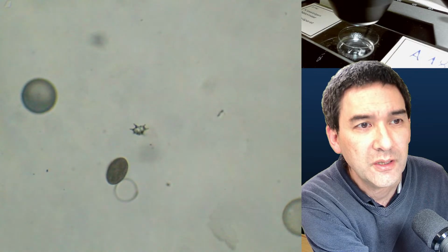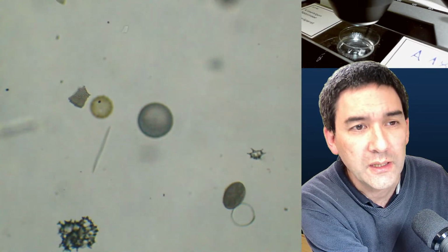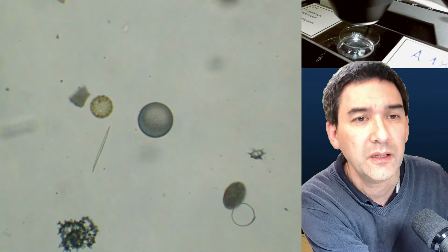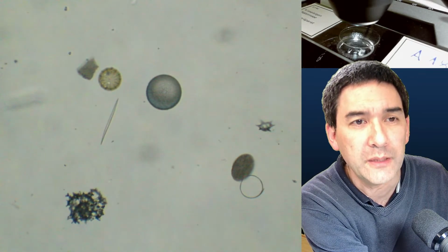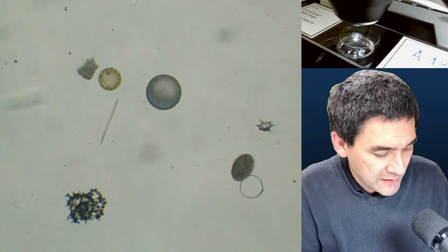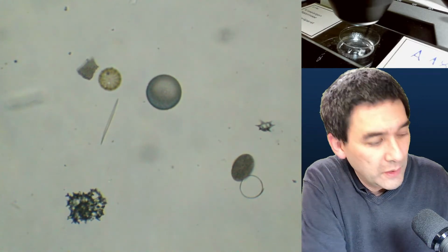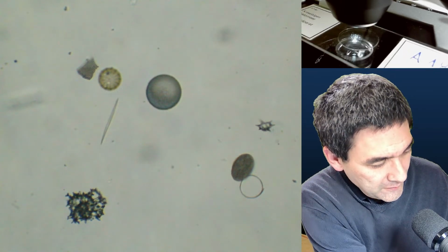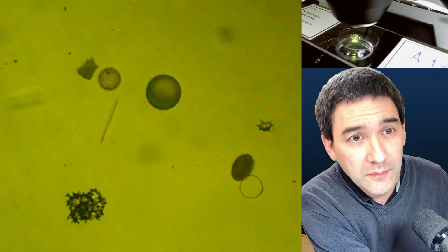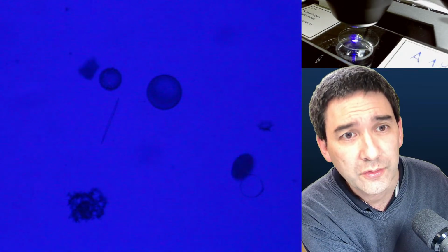Okay, so these are some kind of marine diatom shells. They appear to be dark on a bright background because they of course refract the light away. Let's add now a filter, let's say the blue-yellow one. You turn up the light. I try to find the correct position here.